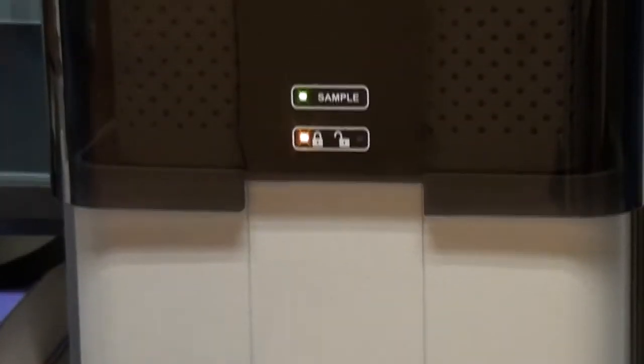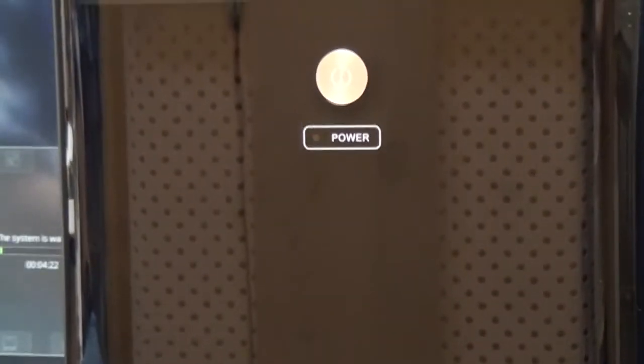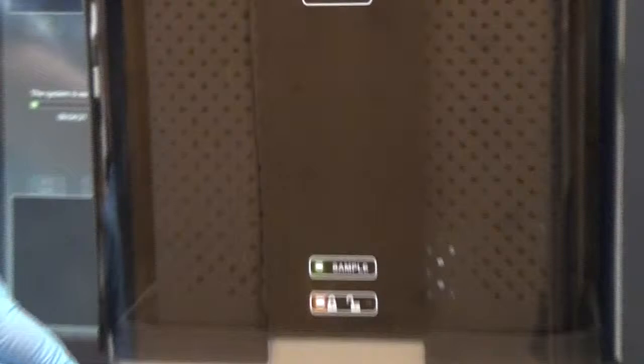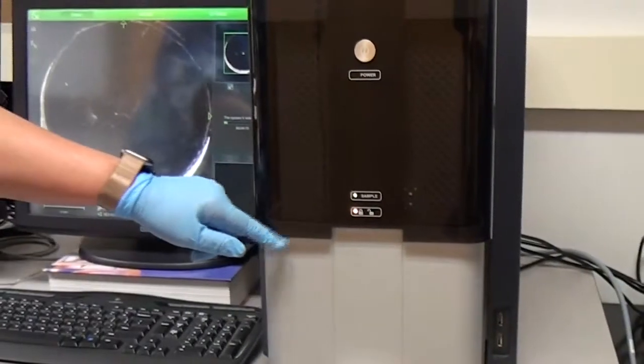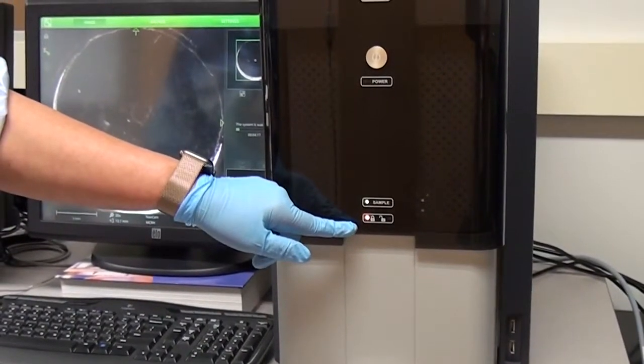The green light on the front of the SEM indicates that the sample is loaded correctly. And now it is in the locked position for imaging.